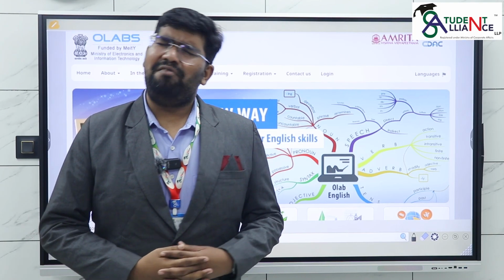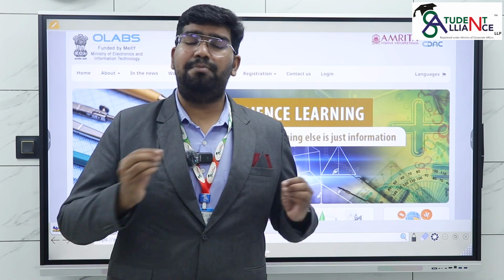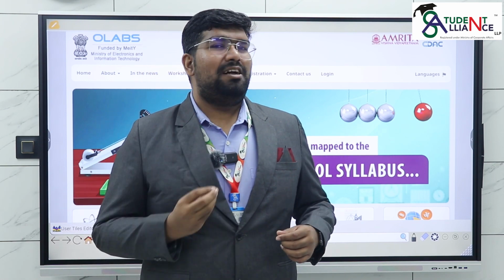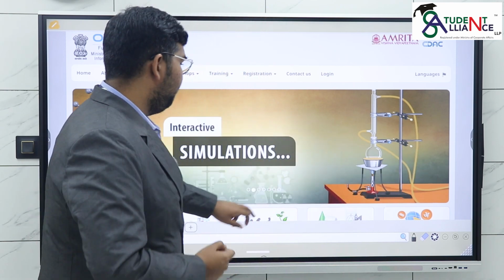Dear educators, have you ever analyzed how exactly you can calculate the carbohydrate, fat and protein content in your organic component? It could be a food, it could be anything.